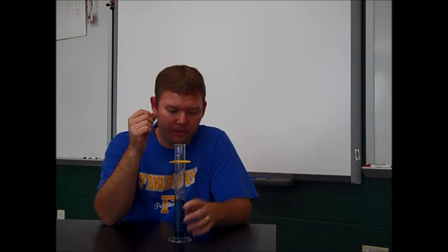Hey, it's Mr. Miller. Today we're going to talk about reading a graduated cylinder. First thing first, this is a graduated cylinder. This is one that we're typically going to use in our classroom. It's a glass 100 milliliter graduated cylinder.